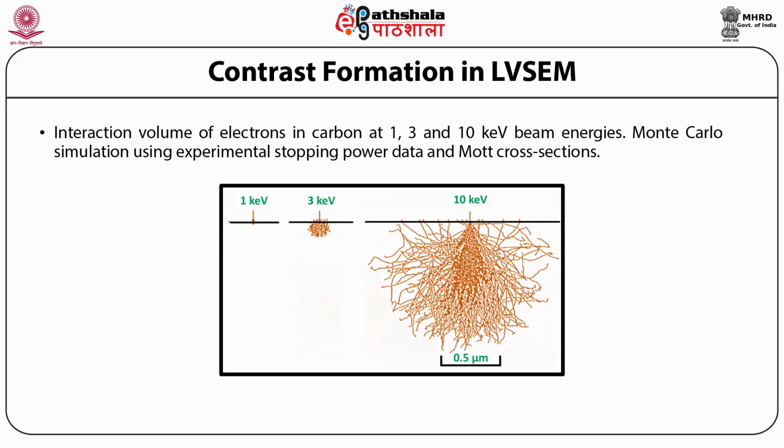The efficiency with which the secondary electron detector collects the secondary electrons from the materials also contributes to SEM image contrast.